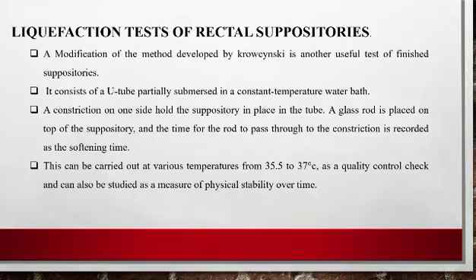Next is the liquefaction test for rectal suppositories. Liquefaction means the suppositories get melted at rectal temperature. It is the modified method developed by Krosansky, which is another useful test for the finished suppositories. It consists of a U-tube partially submerged in a constant temperature water bath. First, we immerse the U-shaped tube into the constant temperature water bath. A constriction on one side holds the suppository in place in the tube. A glass rod is placed on top of the suppositories.